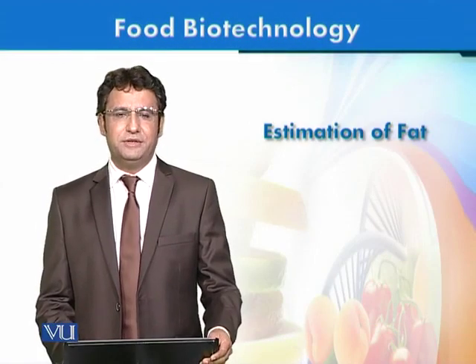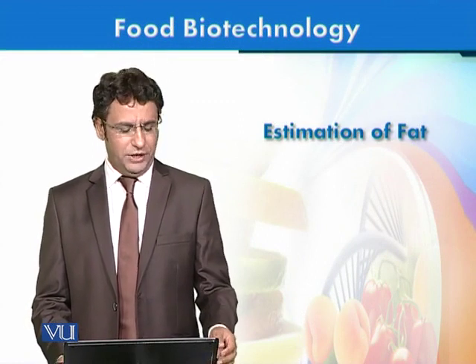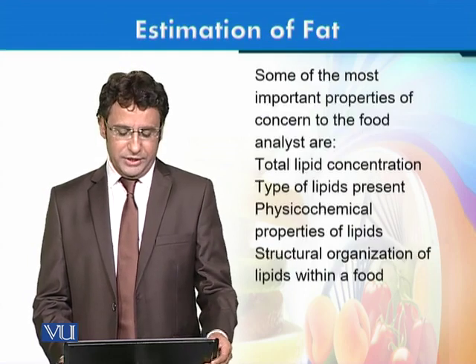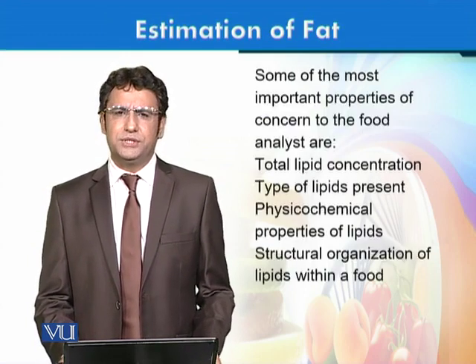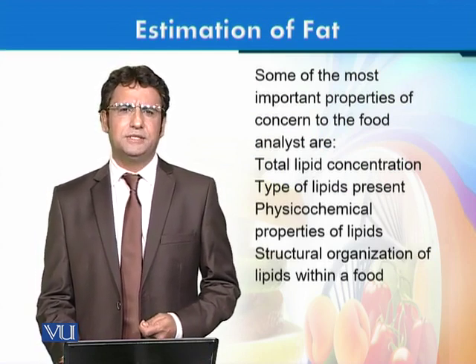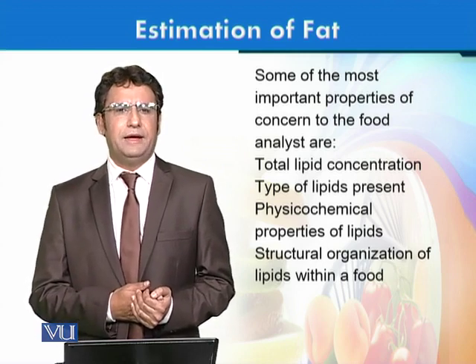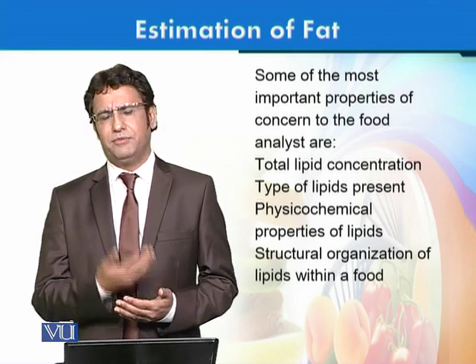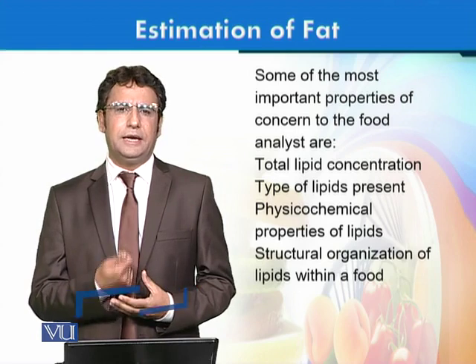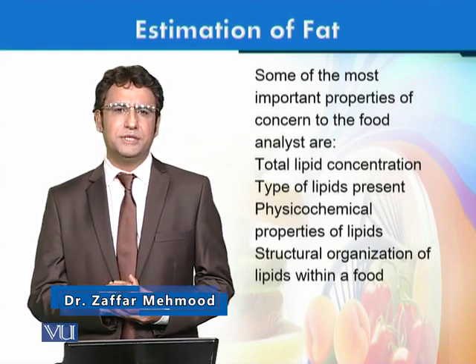Estimation of fat, dear students, is another analytical method that is very routinely performed for proximate analysis of food. While we do this analysis, there could be different types of analysis, like it can measure the total amount of lipids in the food, or it can measure the types of lipid present in a specific food, or thirdly, it might look at the physical and chemical properties of these lipids.